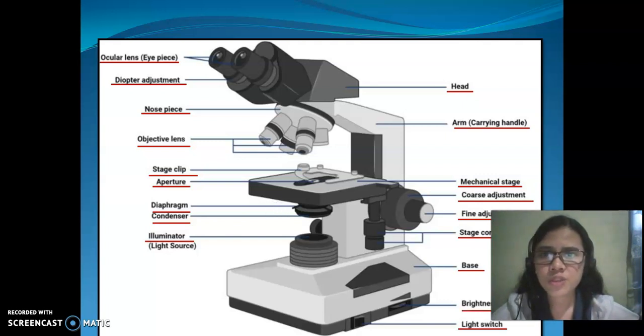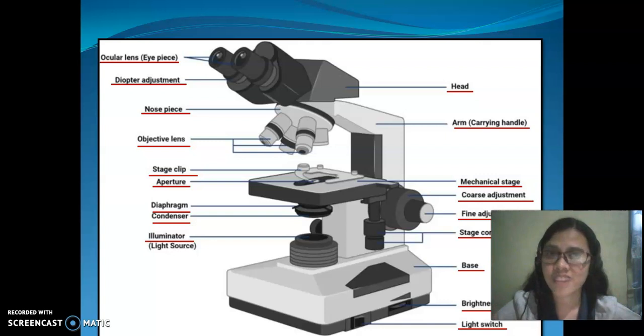The microscope is the most influential technology that allowed us to study and observe things that we would not be able to see with the naked eye. The microscope helps to identify viruses and diseases. These discoveries led to preventative measures such as vaccines.